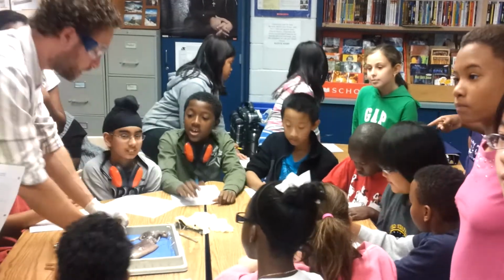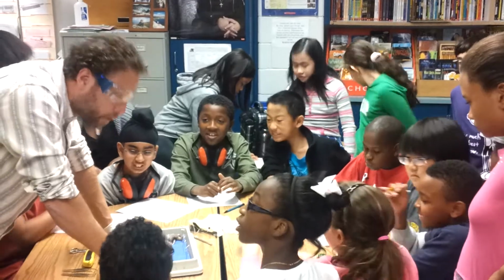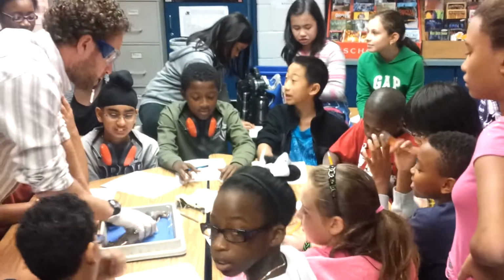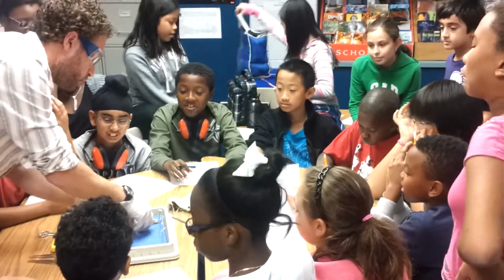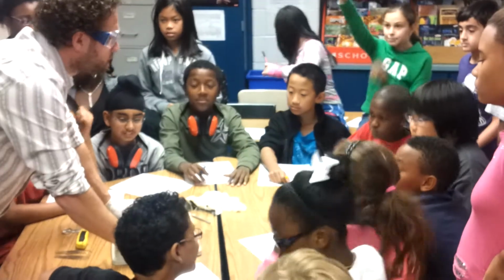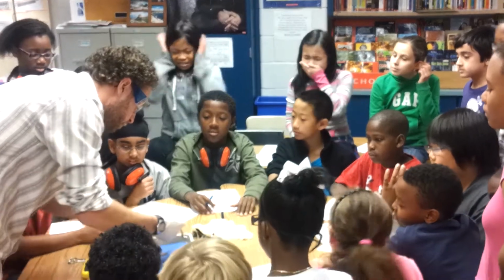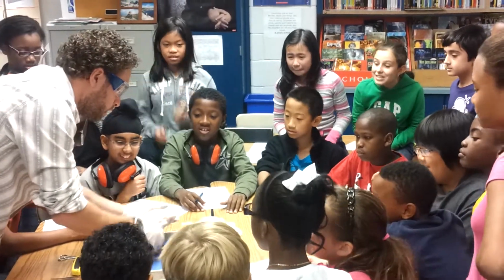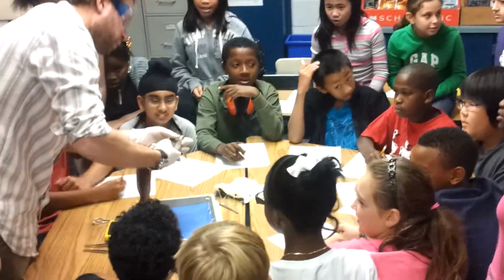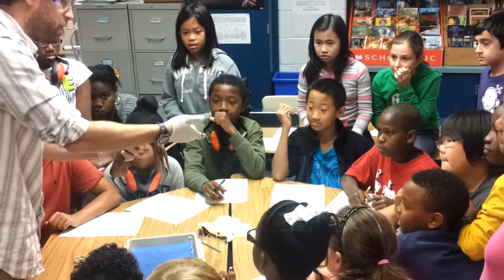All right, okay. Step number 3. Spread out the tentacles. So, ladies and gentlemen, which are long and short? Which ones are long, the tentacles or the arms? Tentacles are longer. So here we go. The longer ones are the tentacles, these right here in my hand.